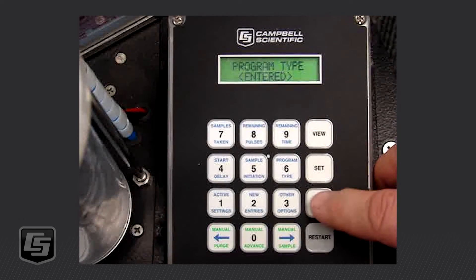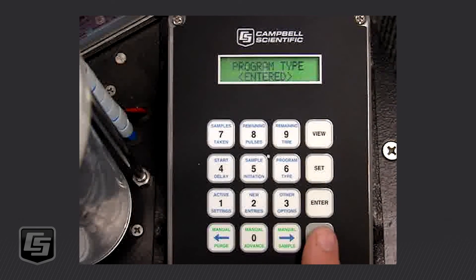We press Enter and we are ready to go. To get the sampler to begin, we push the Restart button twice. It is now set and ready to run. We could leave this sitting from now until next Monday morning and at 8 AM it would begin sampling — taking 90 100 mL samples at every 15 minutes — and then shut off.